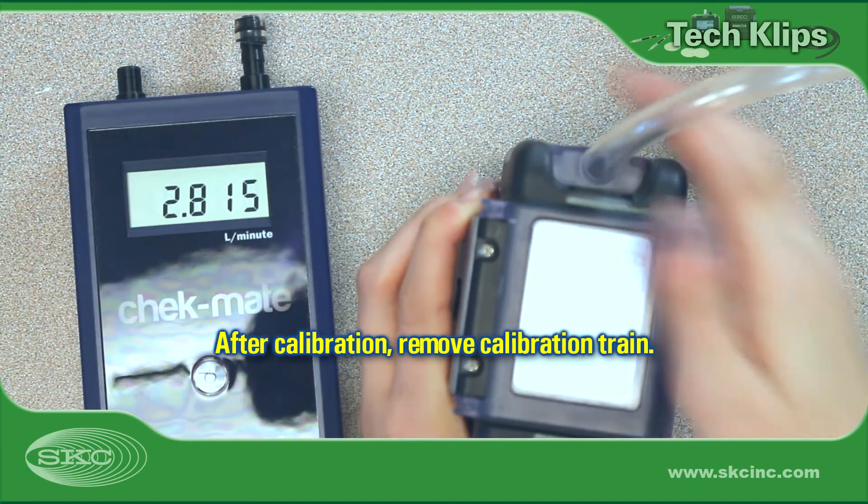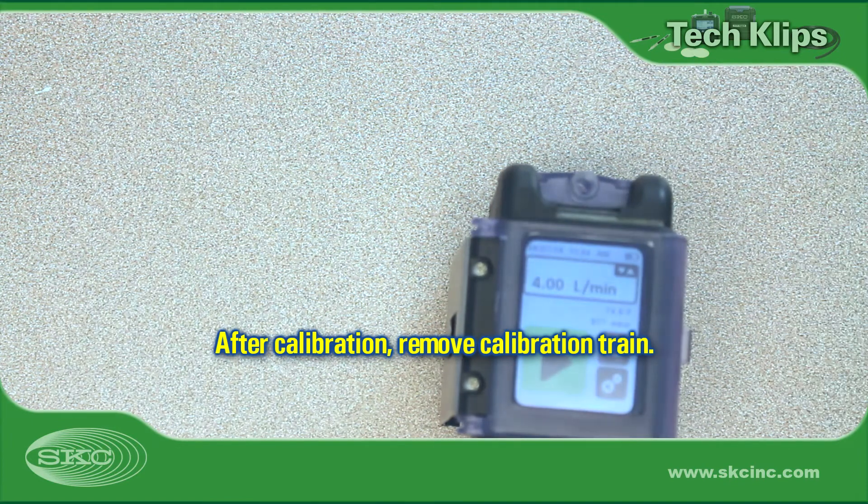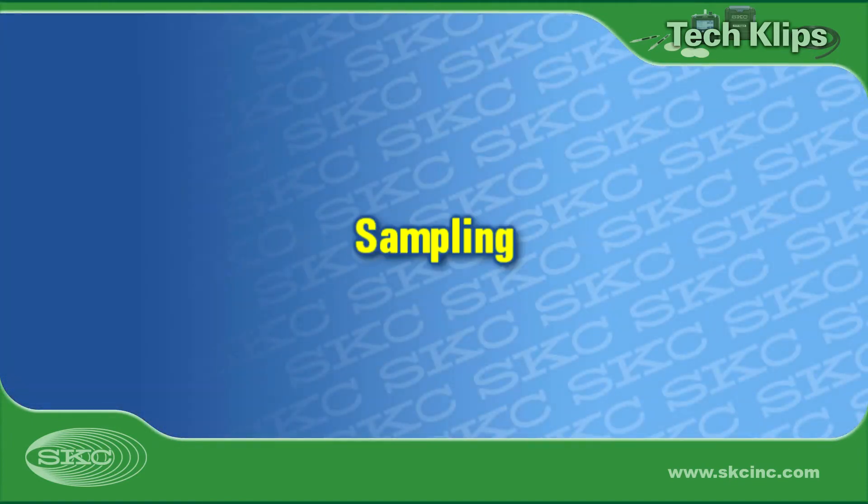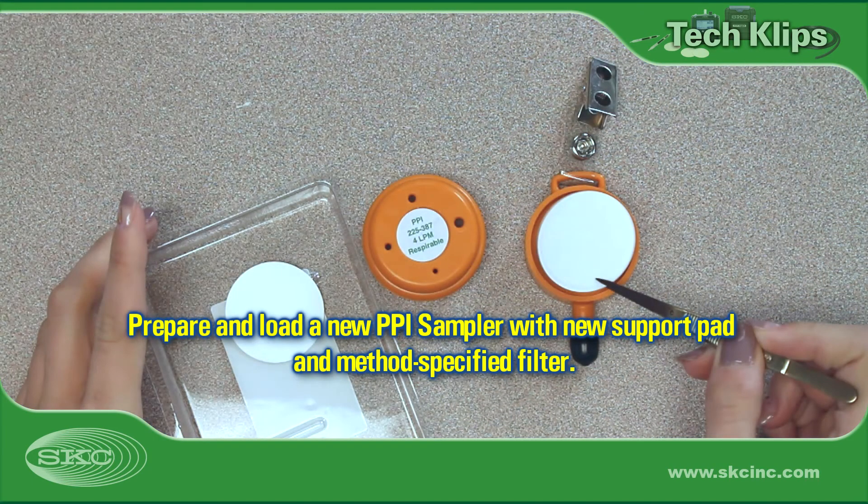Disconnect all items from the pump inlet and set aside for flow rate verification at the end of sampling. We are now ready to begin sampling. Prepare a new PPI by inserting a new support pad and method-specified filter in the sampler base plate.